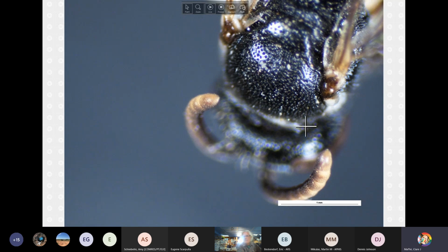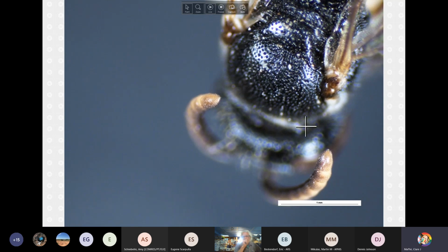Sam, do you have any saniculae to show? I'm just scanning the guide, overall, the conspicuous oval depression between the ocellus, or outside the ocellus. I don't. For some reason, our saniculae sadly had an accident and the head got busted off and disappeared. So no, but it's super noticeable, and the specimens are very rare. So if you get one, that's a really good bee. I believe Melissa, didn't you get some in northern Ohio?